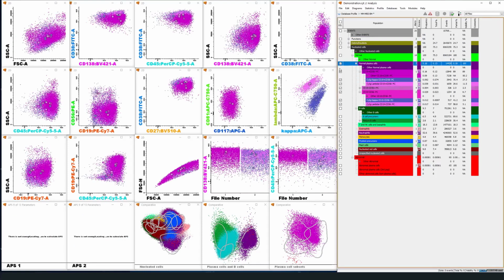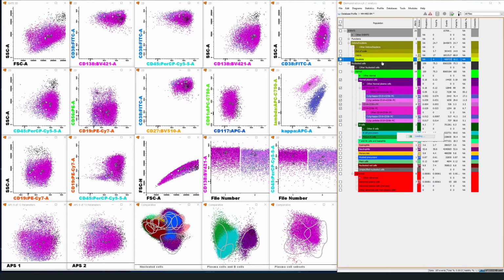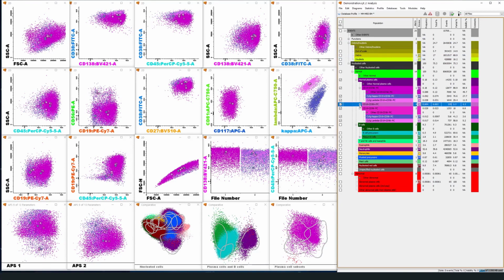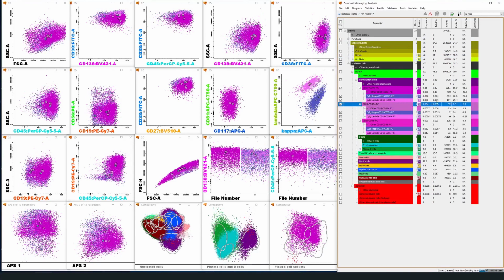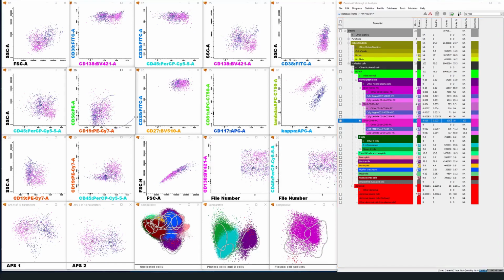So now we have plasma cell populations which appear mostly normal, maybe some doublets here which may be removed to clean them up. You may look over the kappa lambda distribution in these populations, and a safe criterion to take would be around 2 to 1 at most as a difference, but it's somewhere between 1 to 1 and 2 to 1 in favor of kappa in most cases. Here it looks like there's more lambda, but that may be due to the CD19 expression differences, so maybe these are more towards the CD19 positive side.